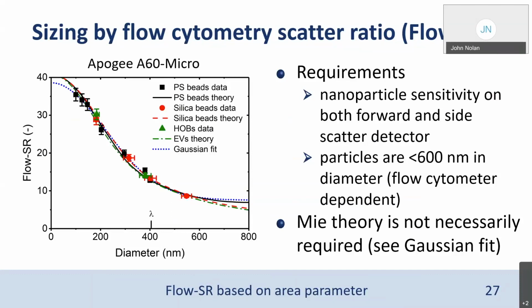Slight concentration difference in the EV, so in the refractive index particles, the refractive index below 1%. So apparently, some chylomicrons end up there, and that you can also see in our results.